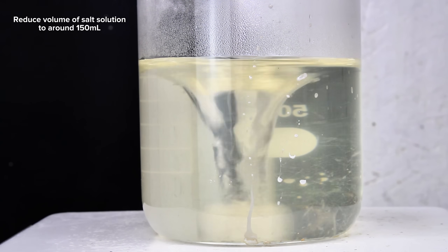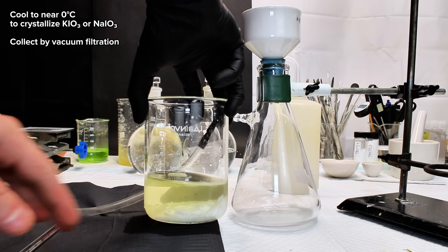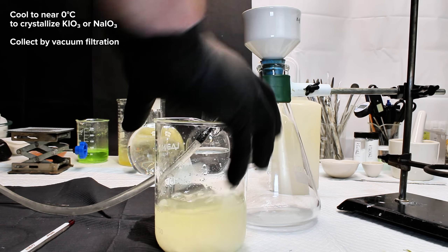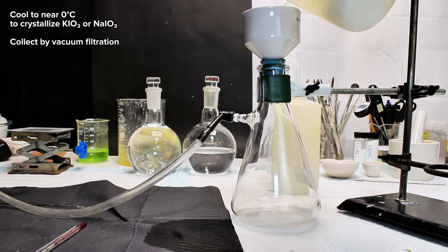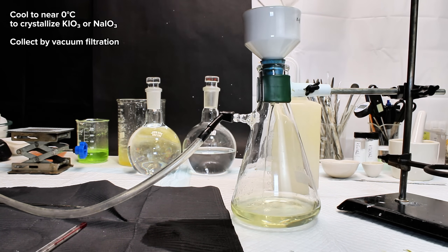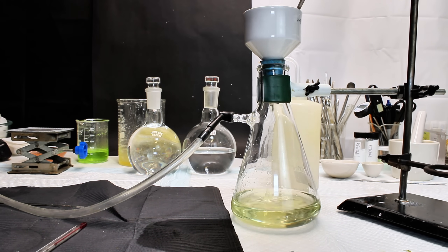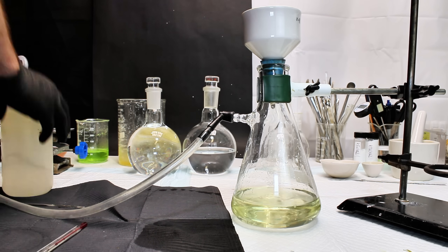This was done to drive off some extra water and to make sure that all of the minimally soluble potassium iodate was completely dissolved. Once I had my total volume down to around 150ml, I took the beaker off the heat and cooled the solution down to around 5°C in order to crystallize out my potassium iodate product. This was collected by vacuum filtration, transferred to a dish, and then dried completely under a day of vacuum desiccation.